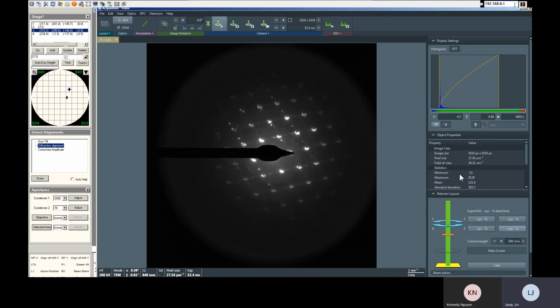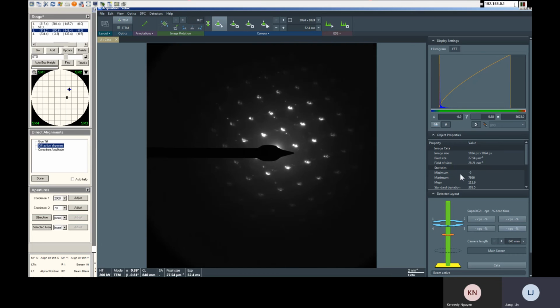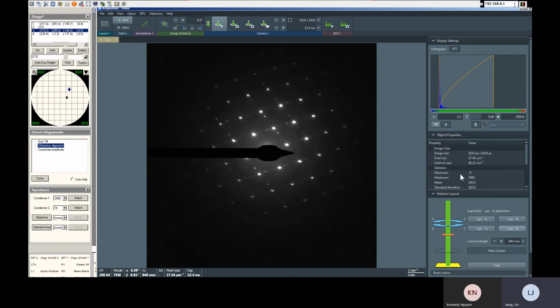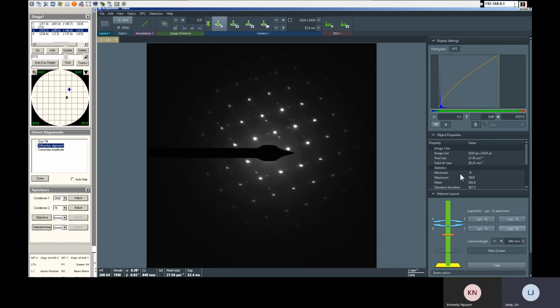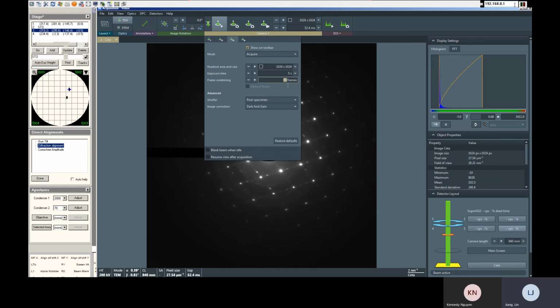Yeah, it's pushing the limitation. It's fine, but a little bit over. Yeah, a little bit over is fine. You want to see this crossover spot, right? Okay. You can set up application.